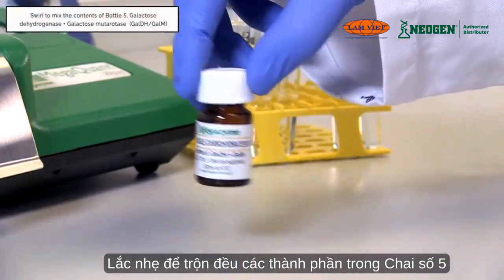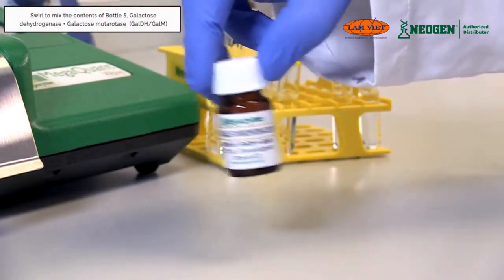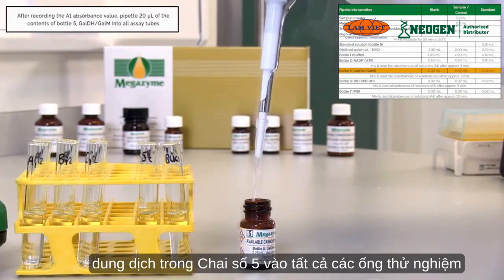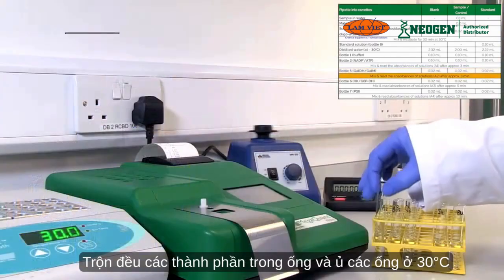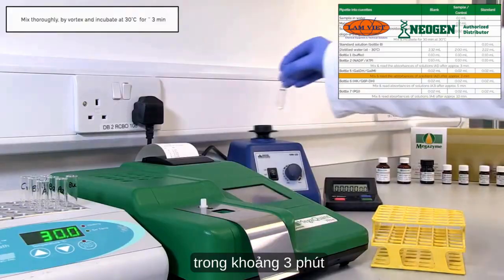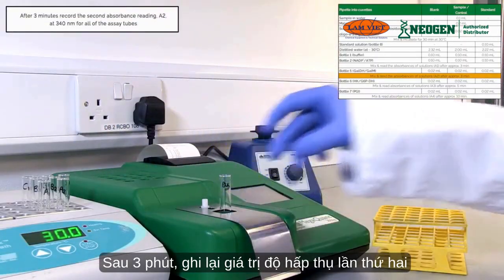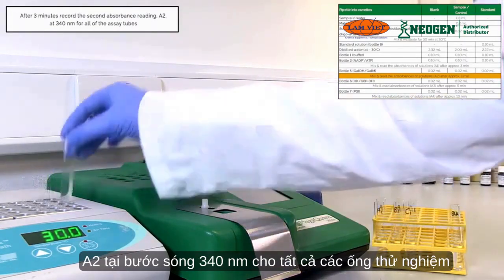Swirl to mix the contents of bottle 5, galactose dehydrogenase and galactose mutarotase prior to dispensing. After recording the A1 absorbance value, pipette 20 microliters of the contents of bottle 5 into all assay tubes. Mix the tube contents thoroughly and incubate the tubes at 30 degrees Celsius for approximately 3 minutes. After 3 minutes, record the second absorbance reading, A2, at 340 nanometers for all of the assay tubes.